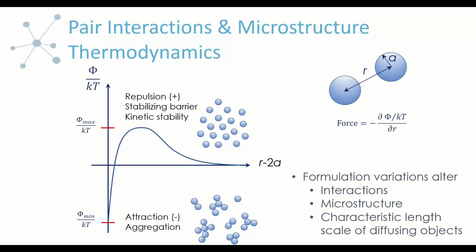And as time goes by, again, they're not static, they're dynamic. As time goes by, they collide, they interact, and they can get stuck together. And this whole process is stochastic, which means random. And over time, these stochastic interactions, collisions, and exchange of clusters with free protein in solution can cause all sorts of different changes in the fluid structure, but also these large clusters can then collide with other clusters, forming giant aggregates. And over time, aggregation is destined to occur because proteins are metastable in solution.